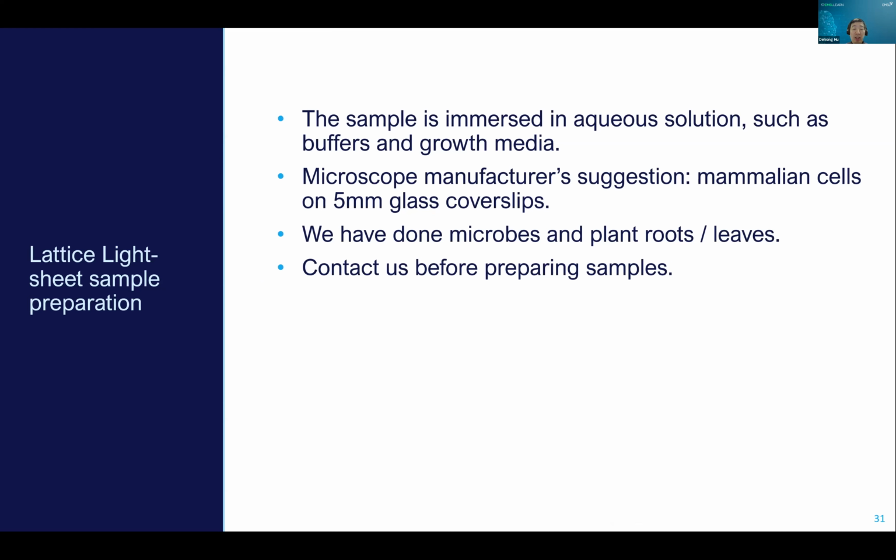Since we are a DOE lab, we are interested in other kinds of systems, so we have done microbes and plant roots and leaves. For the sample preparation, I suggest you contact me before you prepare the sample. If you put something on a microscope slide, like tissue on the microscope slide, that will not work. So I suggest you contact us before preparing the sample.